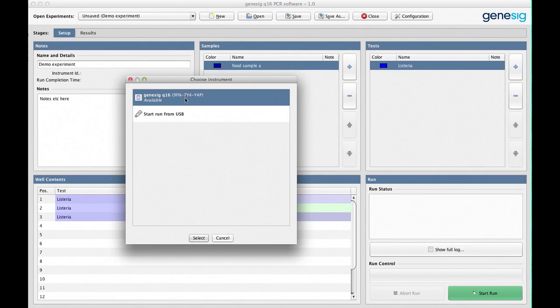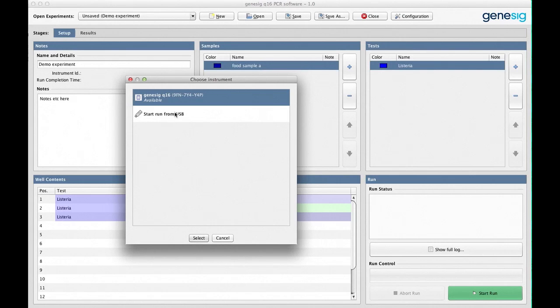If you have more than one Q16 connected you can select which one you're using here. Or if you're not connected directly and want to run the Q16 from a USB stick you can select that option here too. But we're using this instrument so away we go.